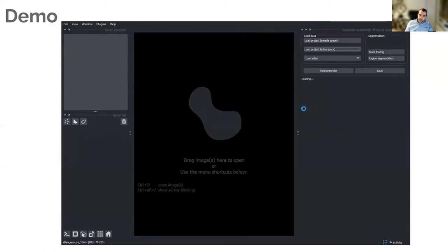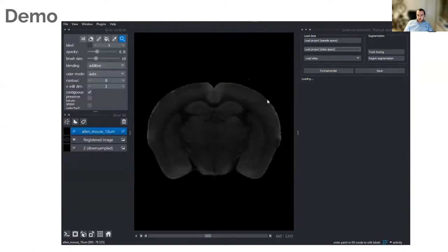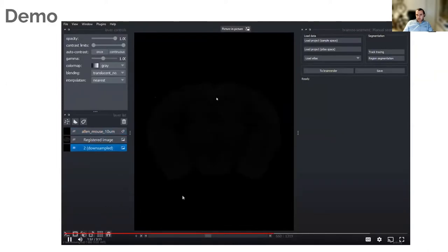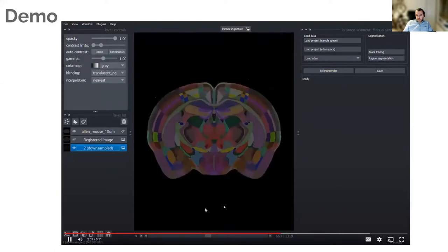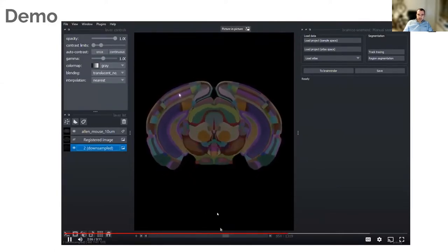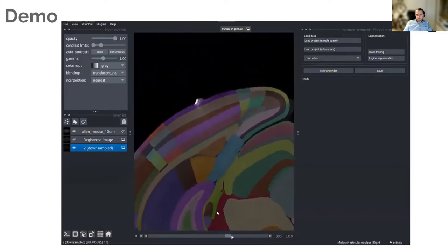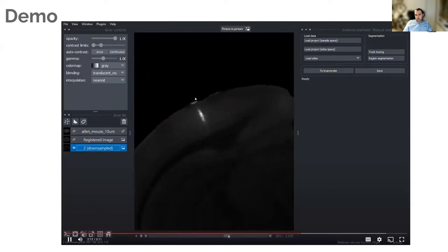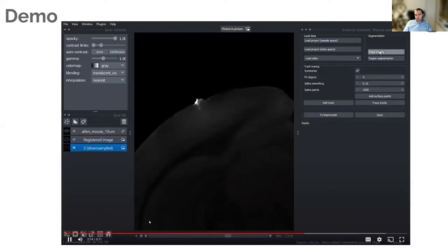We'll reload the same data back in. The only difference is everything will be warped to the Allen reference frame, to the CCF, which is why you should see that the brain is a slightly different shape now, and it's perfectly symmetrical and perfectly aligned. But the data is still the same data. It's fine for these shape-based analyses, but you wouldn't do any sort of fluorescence intensity quantification. Here we can see the probe track again through visual cortex. And we have two different panels, one for region segmentation and one for track tracing, which is for one-dimensional tracks that you want to trace through the brain—in this case, Neuropixels probes.